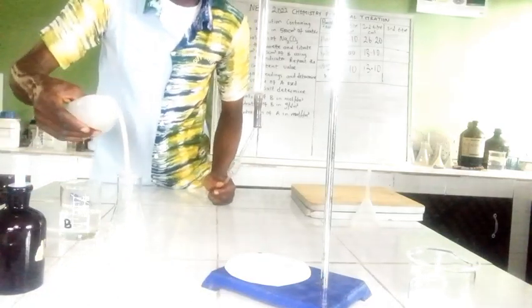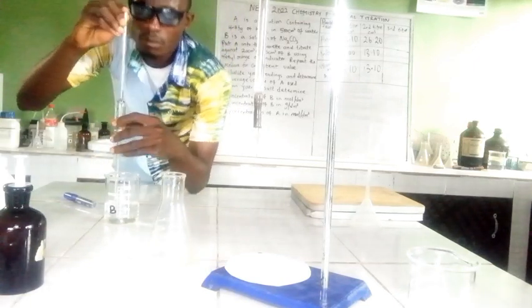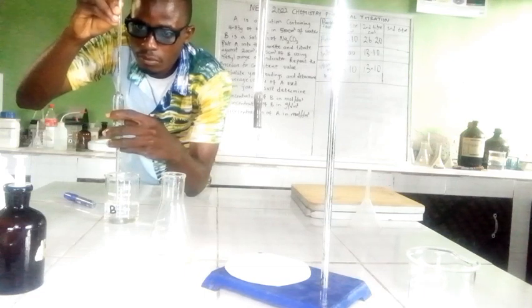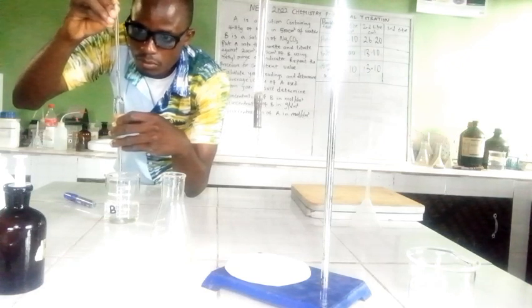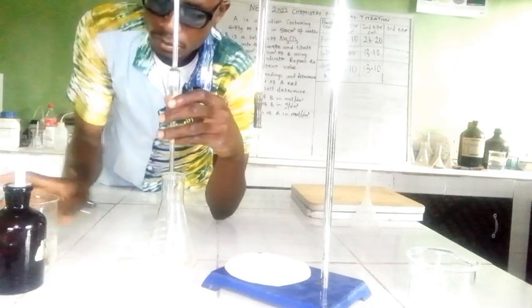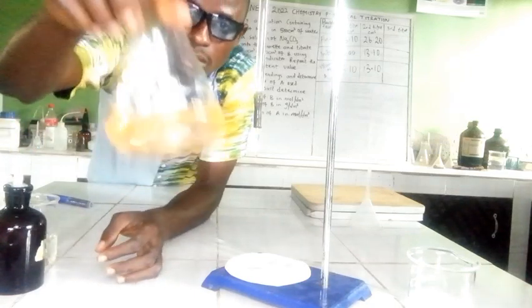Don't forget that I have to rinse with water again. Okay. Good. So there again, I have my indicator. So this is it.